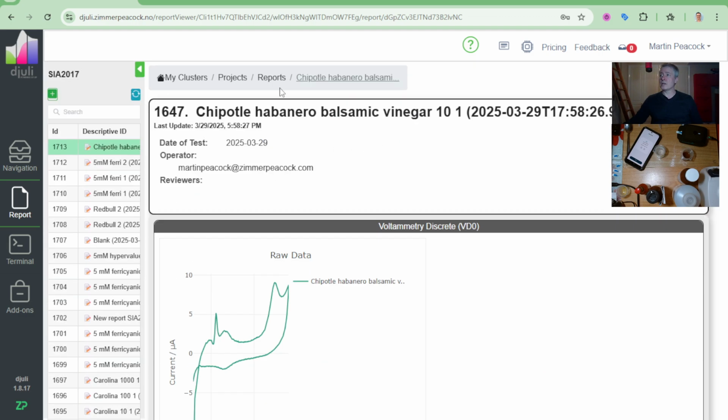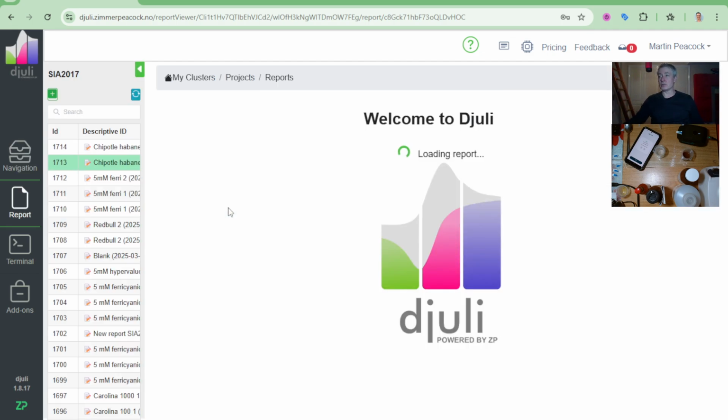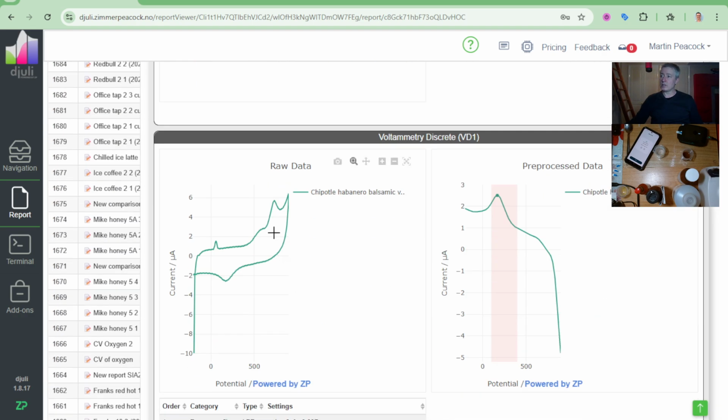And now I've just done it again, and this time I got about 1,530-ish. Let's just do a quick refresh on that. Understand that 1,601 and 1,530 are basically the same number with just a little experimental difference between the two. But these are genuine, real samples. So we got good repeatability, and it also gives me that reassurance that the number we're giving you is real. So you've got nice strong signals.